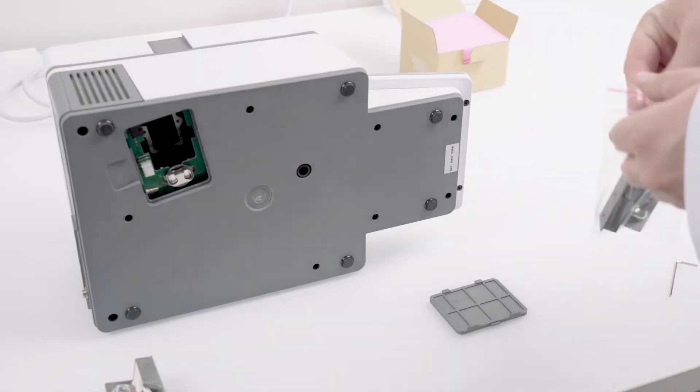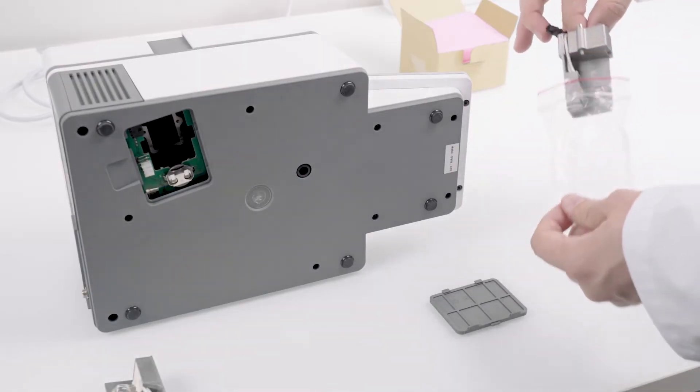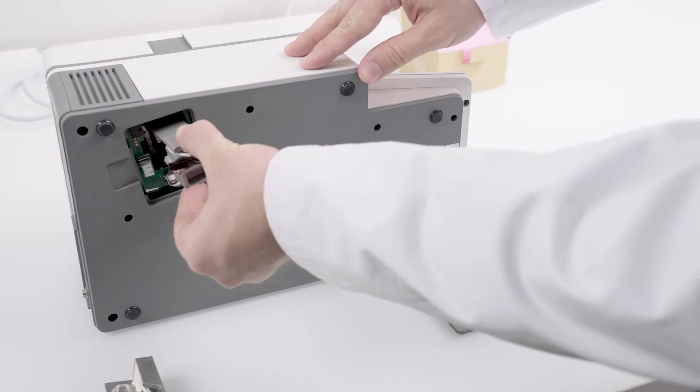Unpack the new lamp module. Do not touch the light bulb. Insert the new lamp module and tighten the two screws with the allen wrench.